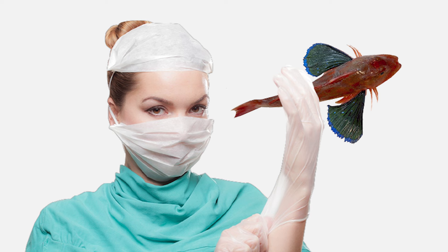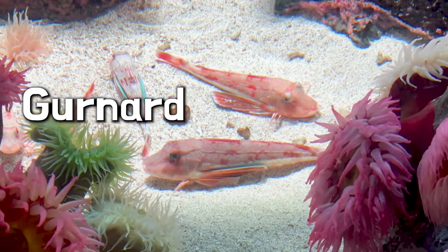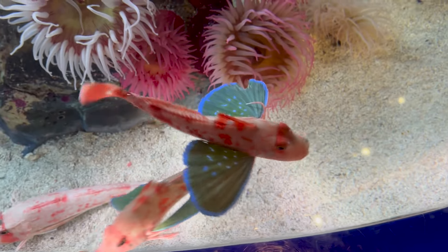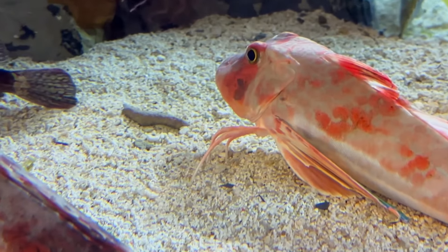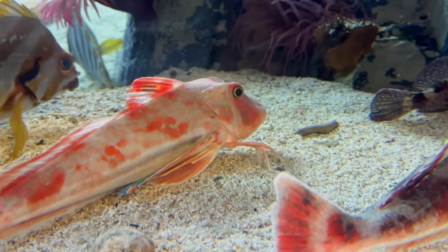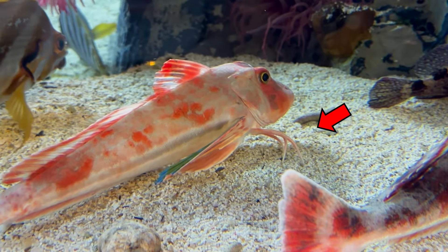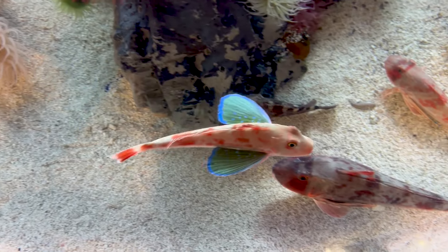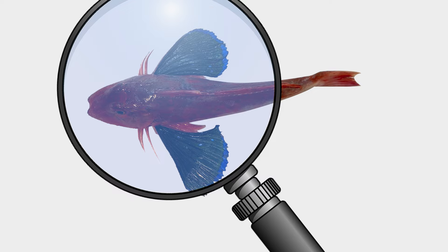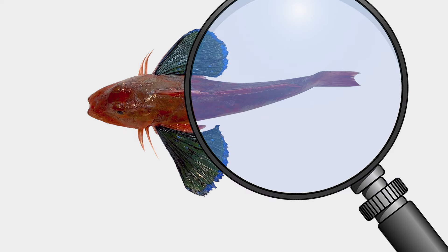Fishy science. Today, let's dissect a gurnard. This is the gurnard. It may look ordinary, but when it swims, its blue wings unfurl. The most astonishing fact about them is they're fish that possess legs. They crawl on the seabed with six legs and swim as if they are flying through the sea, hence they are dubbed the butterflies of the ocean. So today, we shall delve into the anatomy of this mysterious fish.